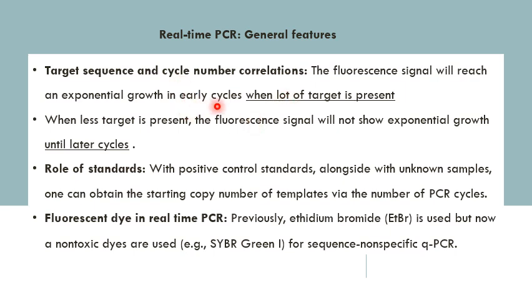While when you wait for more cycles, let's say here it is, for example, 16, compared to the other side, for example, here 16 and here, for example, 30. It means here it reached a later cycle with 30 cycles, so you can barely detect your fluorescence or your template.